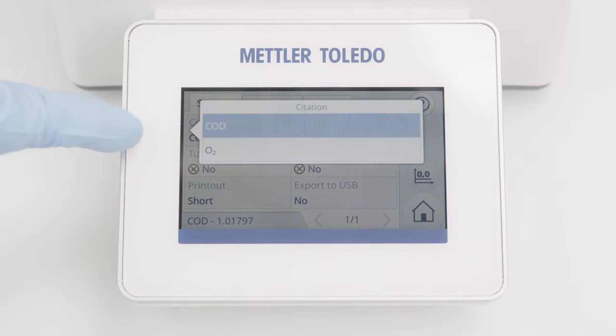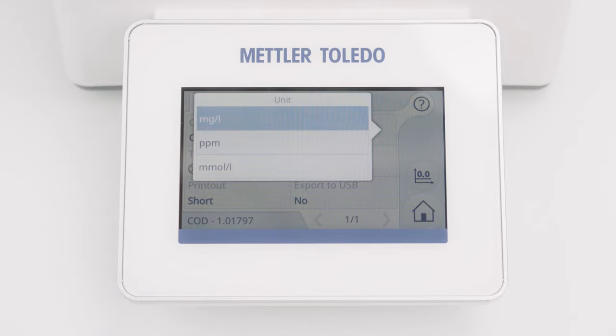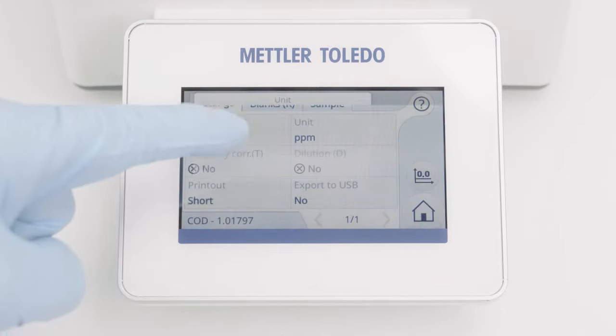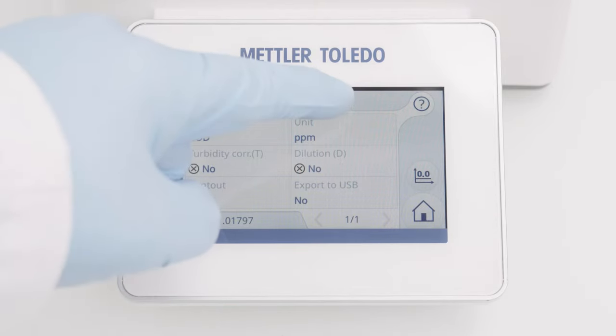In the Settings tab, I can define the desired citation, the desired unit, and other test kit-specific parameters. Now the method is ready to use.